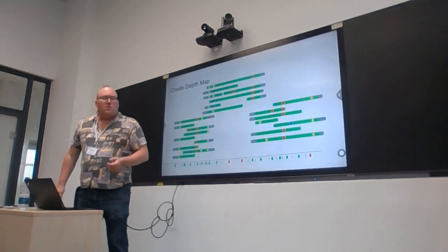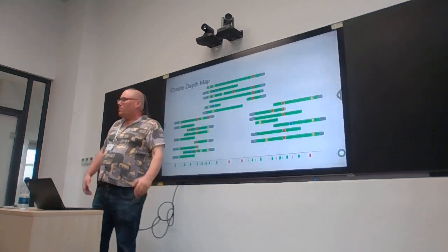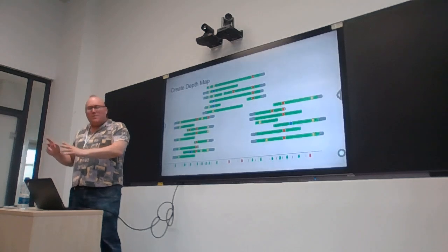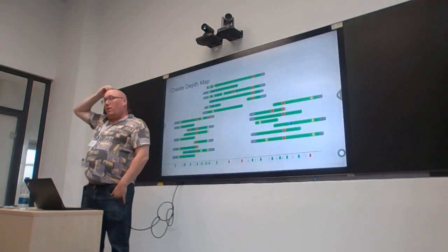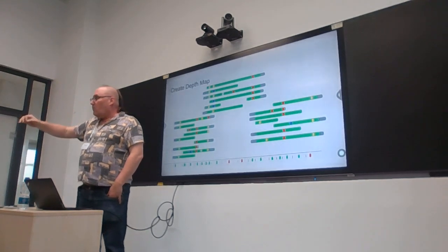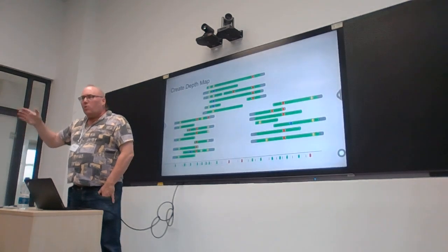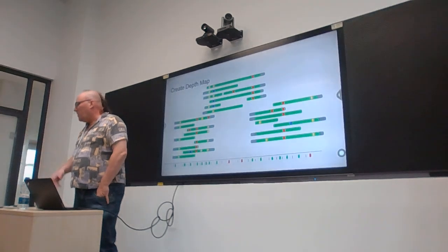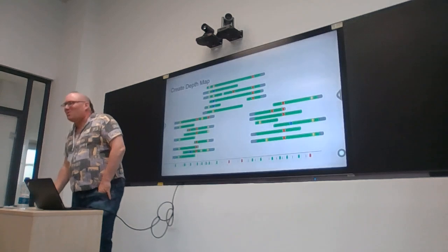Yes. But if somebody uses negative control. But what if somebody doesn't use it? Then they're really playing with fire, right? Does everybody use a negative control in their sequencing? I hope so, right? One of your samples must be water, nuclease-free water, right? You know what I'm talking about with the negative control, right? Okay. What's that in French? Contrôle négatif. I thought so.